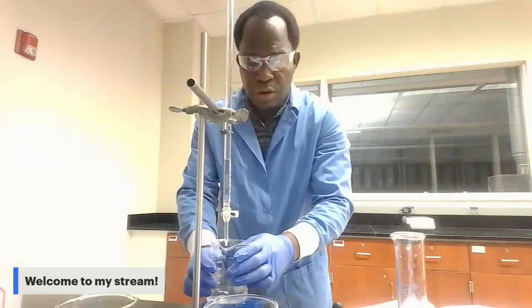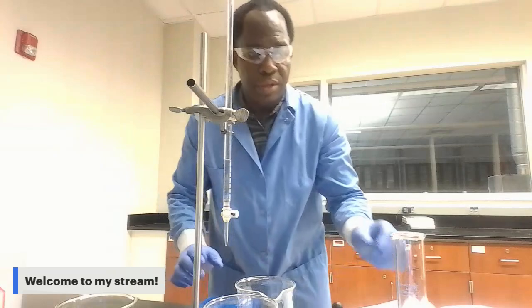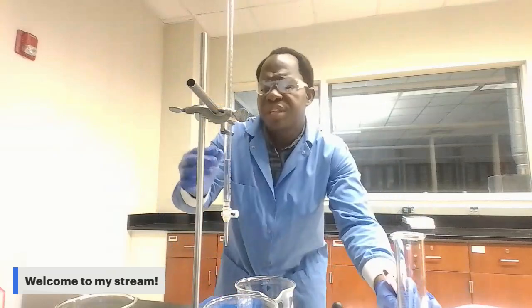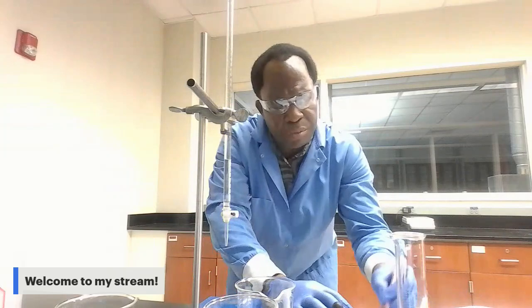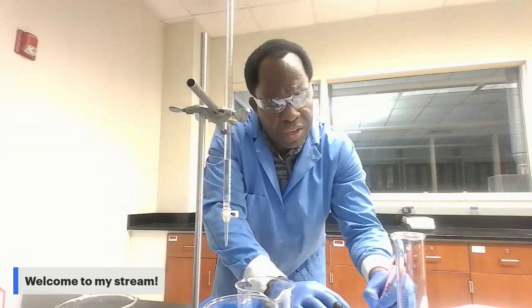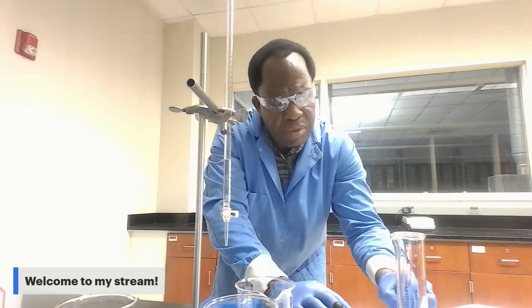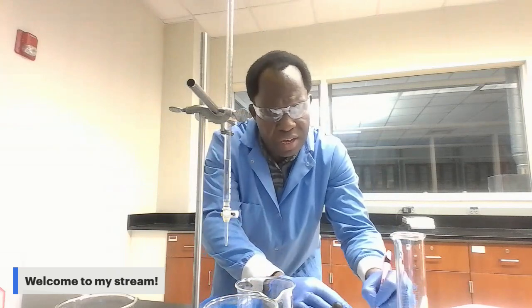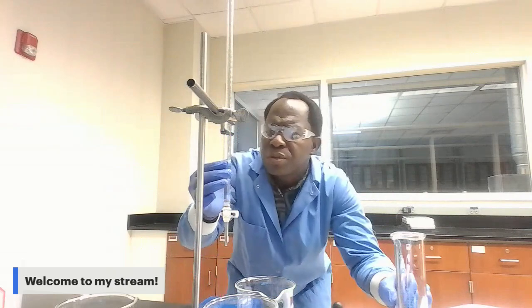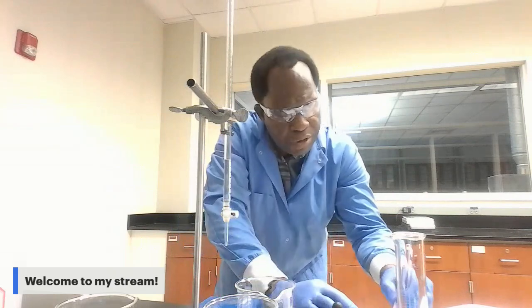Change in the color of the solution. So as soon as we get that, I'm going to proceed again to the reading, the volume. So this time we move from the volume of HCl of 29 milliliter to the final volume of HCl equal to 43.5.